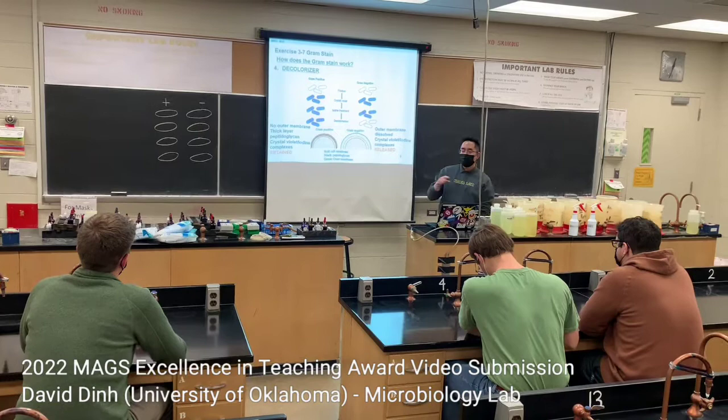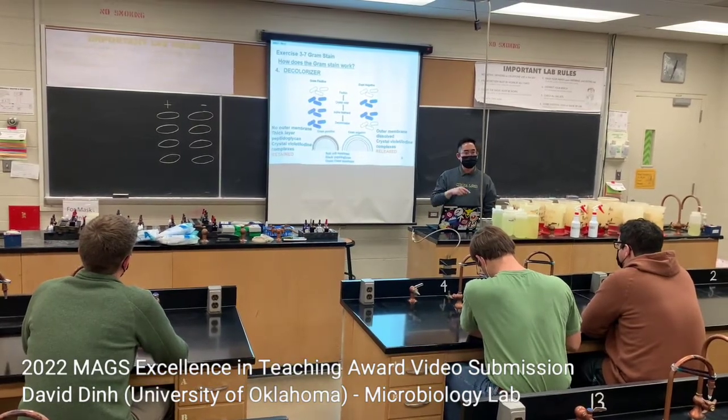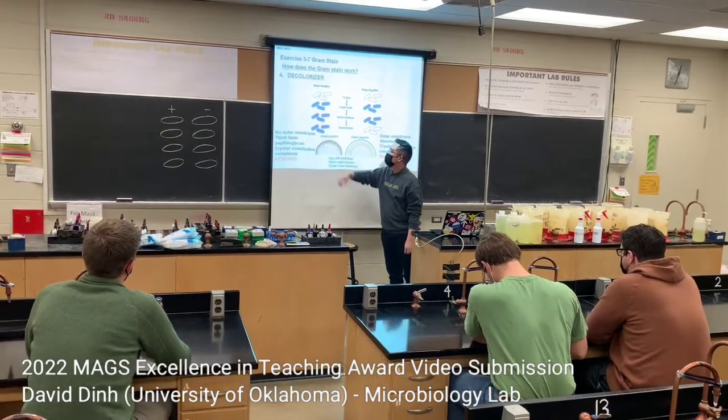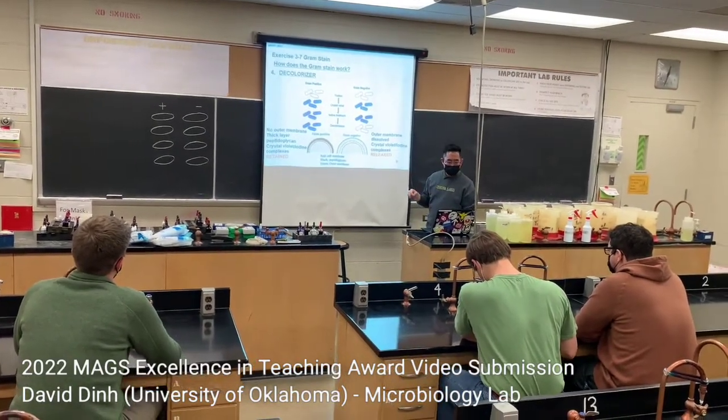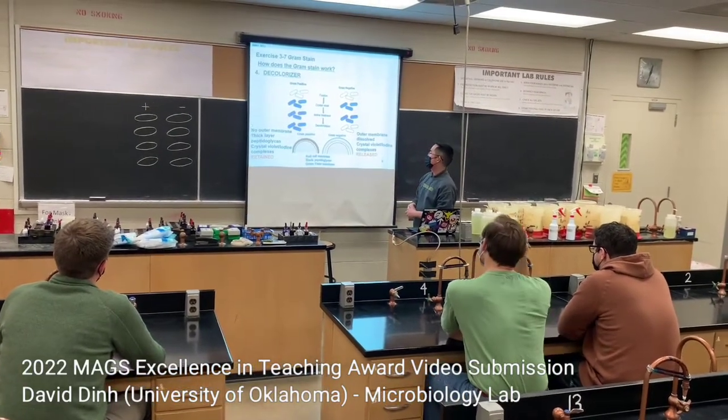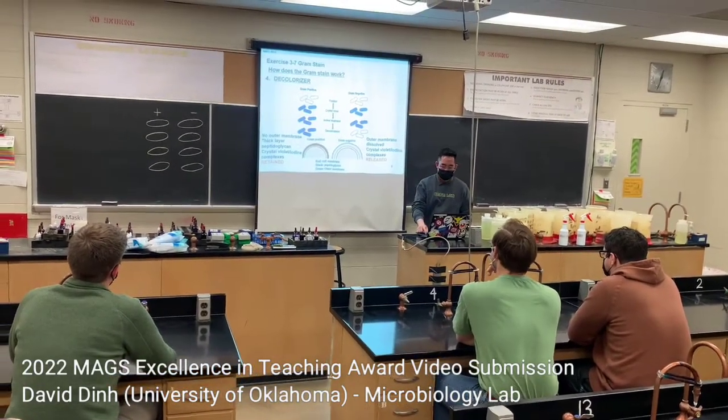Remember, the purple stains both organisms, it stains the outer things surrounding them. So the gram positive has an outer layer that still retains the purple, and the outer membrane of the gram negative got released by the ethanol.